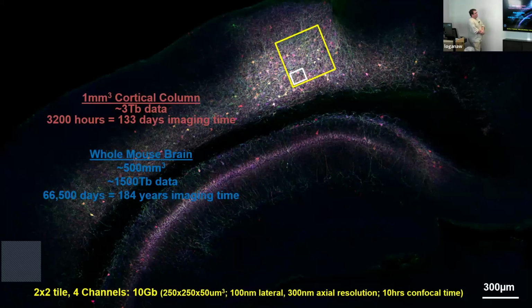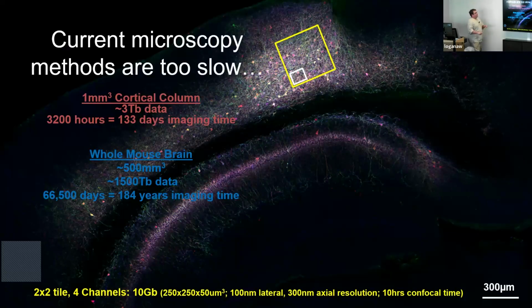But now the challenge here is that if we use the same imaging approaches that I showed you in those two figures just now, and scale them up to capture a whole mouse brain, it's not as bad as the math that I showed you for electron microscopy. But there are still experiments that would take days or hundreds of days for something that's a millimeter cubed, and they would take years for a whole mouse brain. So it's a very similar issue.